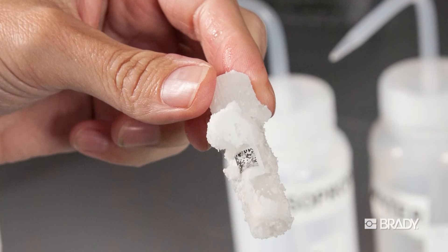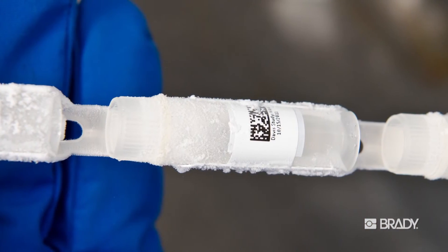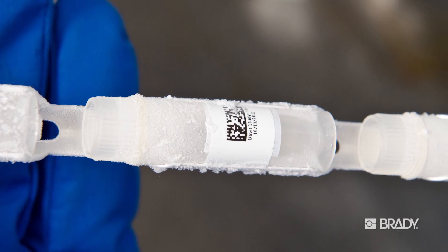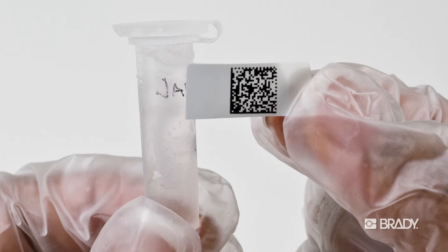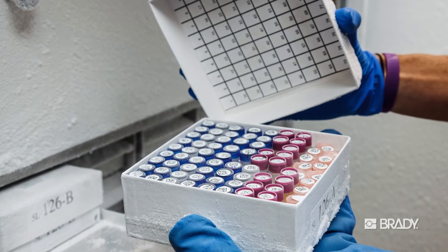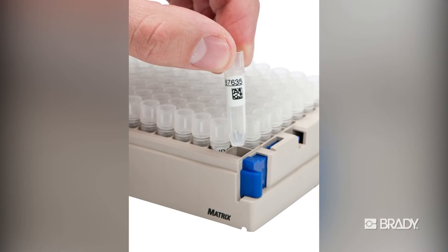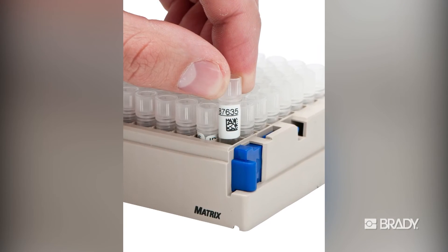There is a high degree of opacity, so if you are covering up an identifier already in place, no print will show through, so that labs will meet HIPAA requirements. Another advantage is that Freezer Bonds is a low-profile label, meaning it is extremely thin, so it will slide easily in and out of racks without damaging the label.